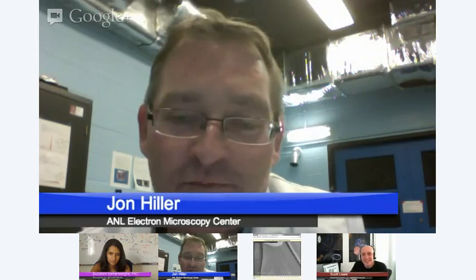And so imagine if you now take another column, what I'm calling a column, another imaging device, and you slap it on the side of one of these microscopes here. But instead of throwing electrons down, let's throw a big gallium ion down, a positively charged big bowling ball, and steer it. But we have to steer it with lenses. Because it's a positively charged ion, we don't use electromagnetic lenses. We'll use electrostatic lenses.